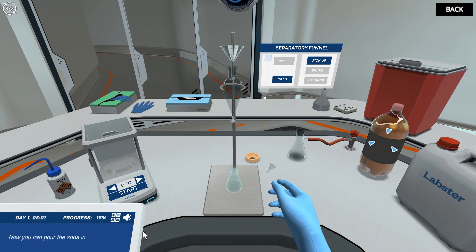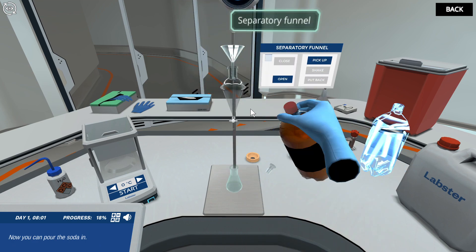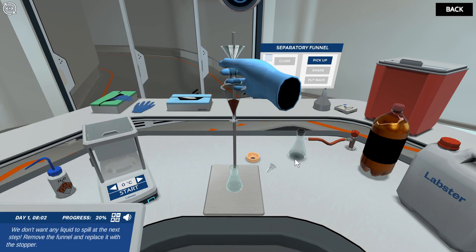Now you can pour the soda in. We don't want any liquid to spill at the next step. Remove the funnel and replace it with the stopper.